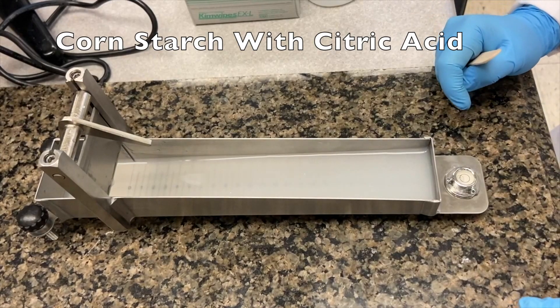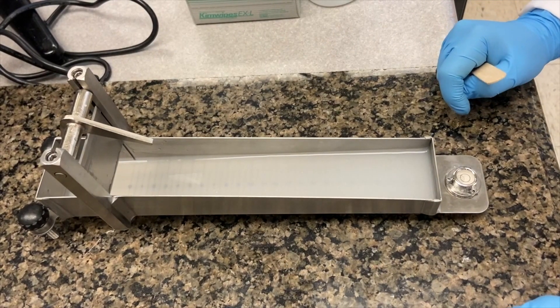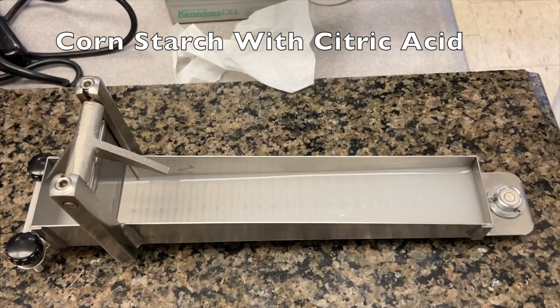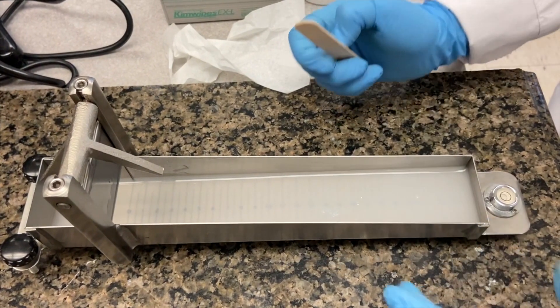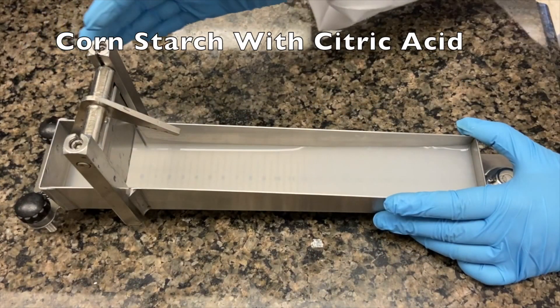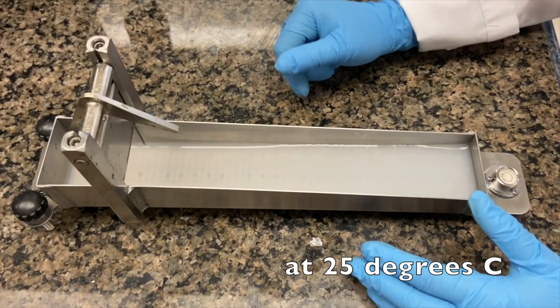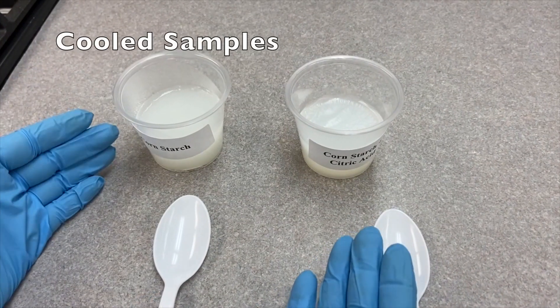This is the cornstarch plus citric acid at 55°C. Now at 40°C — you can see it reached 24 centimeters. Last reading for cornstarch with citric acid at 25°C — you can see it's still watery.